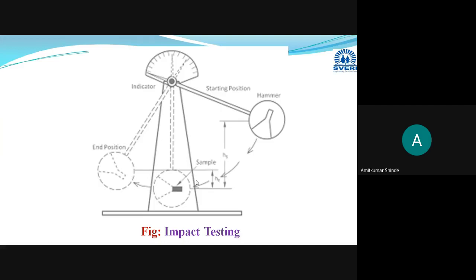Okay. Now I will move towards the actual testing. In today's session only, we have to complete this. Only two, these two will be the last testing methods. Now this is the arrangement. I will explain it. This is the arrangement for conducting the impact testing.